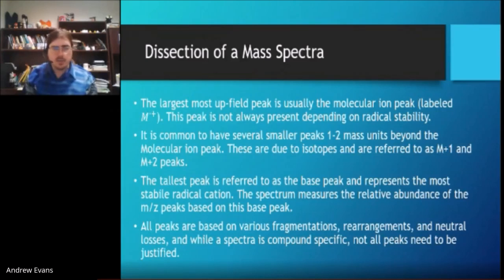Now, oxygen has an 18 isotope, and that's pretty small. But there's 2 oxygens, so you would double up the chance. So there'd be a tiny blip of a mass of 46. And there'd be an even smaller blip of a mass of 48. And there, of course, might be a small blip of 47 and 49, basically of isotope of carbon-13 with an isotope of oxygen 18.